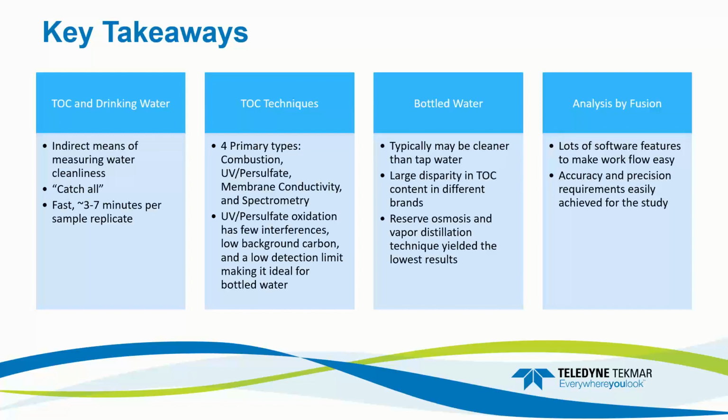So once we chose the correct technique, we then take away from the bottled water. What do we look at here? Well, bottled water may be cleaner than tap water. There's a difference between brands, different filtration processes, cleaning processes, which shows some differences. And when we look at the different types of distillations or cleaning processes, reverse osmosis and vapor distillation techniques yielded the lowest results.